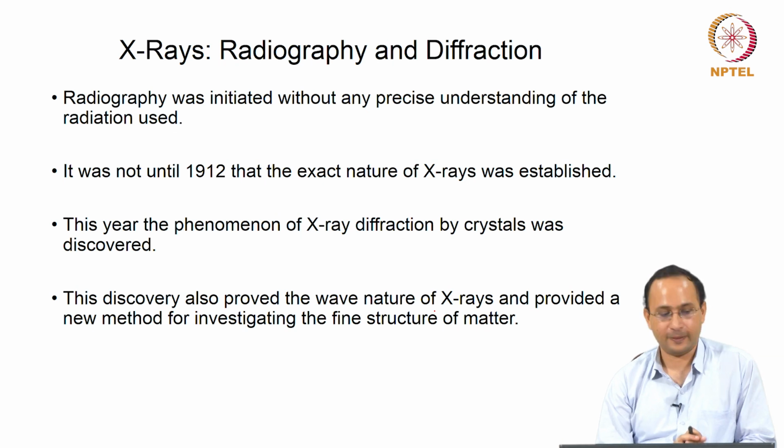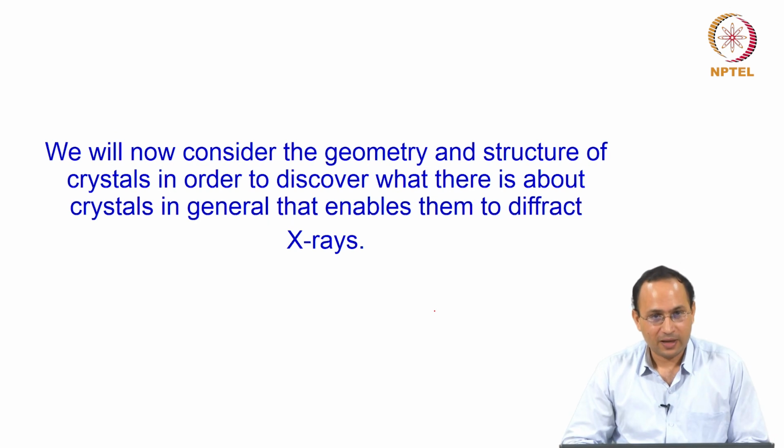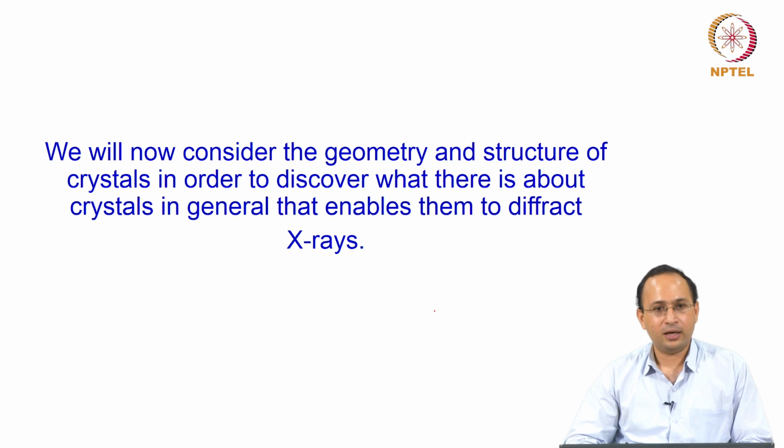This discovery also proved the wave nature of X-rays and provided a new method for investigating the fine structure of materials. So now we know what X-rays are, how they are generated, and what is so unique about X-rays that we can use to probe crystalline materials. Now we will consider the geometry and structure of crystals to discover what it is about crystals in general that enables them to diffract X-rays.